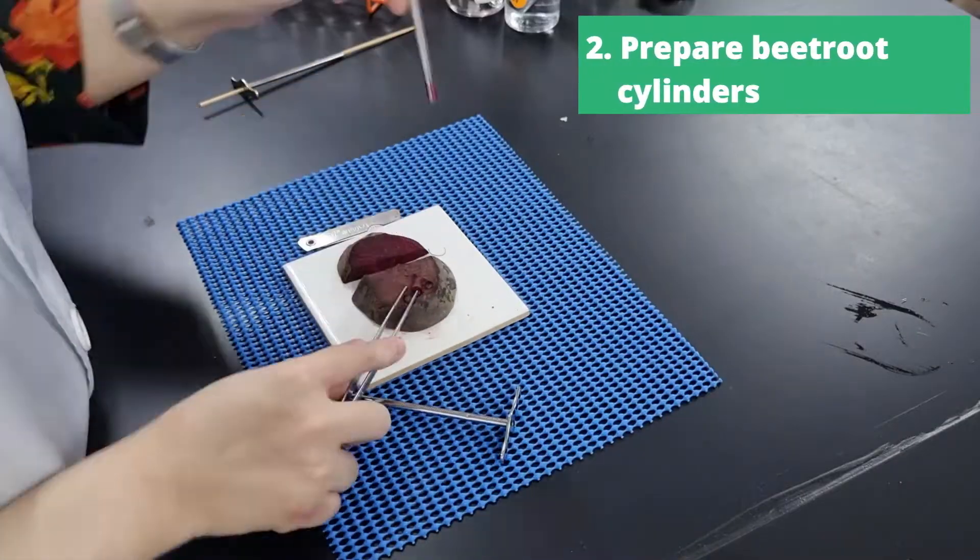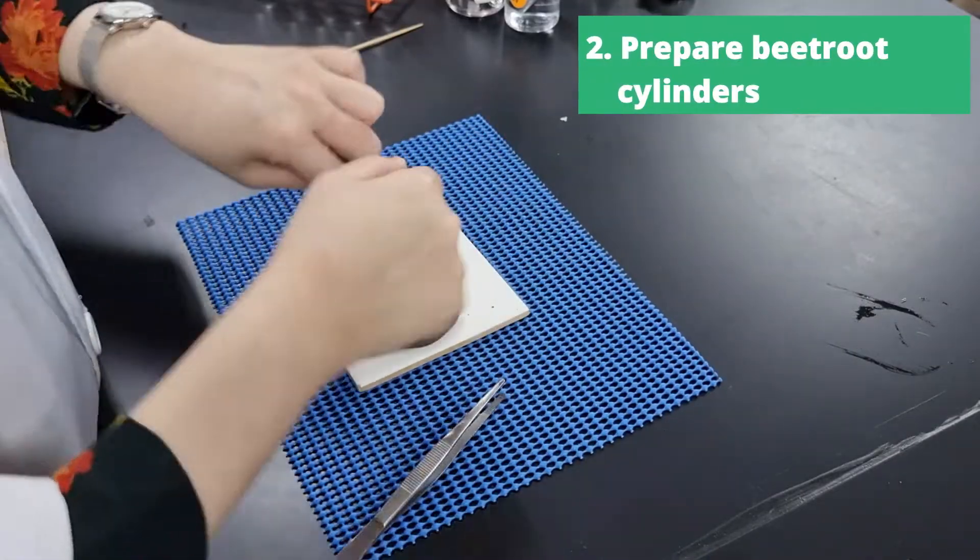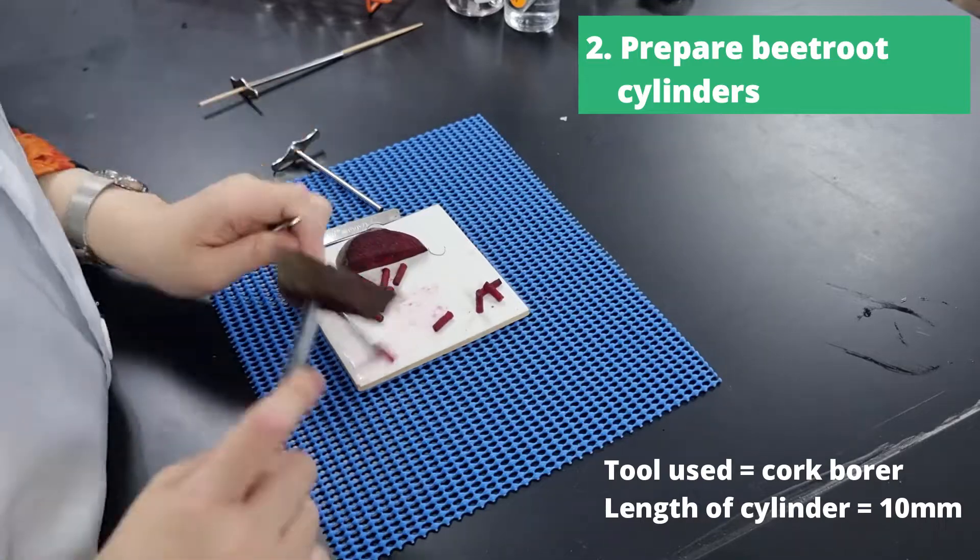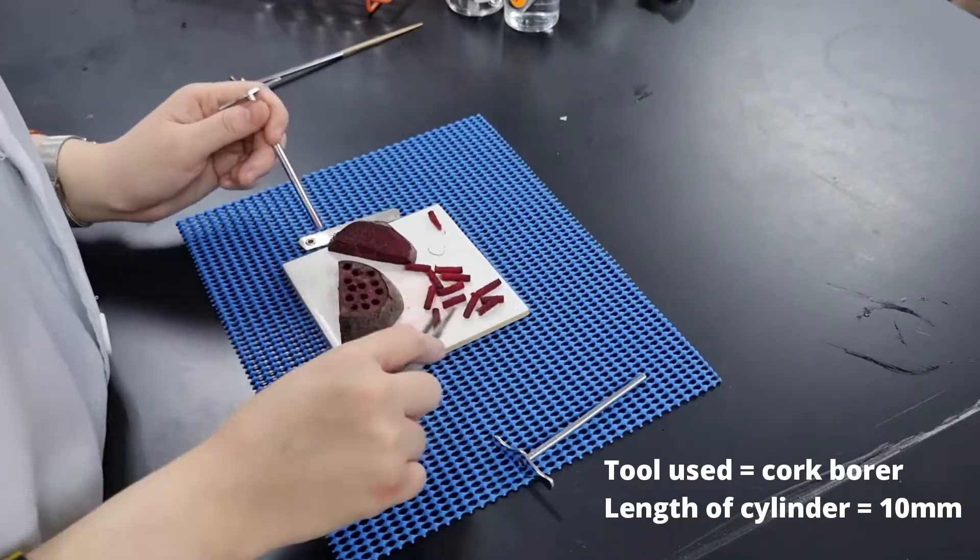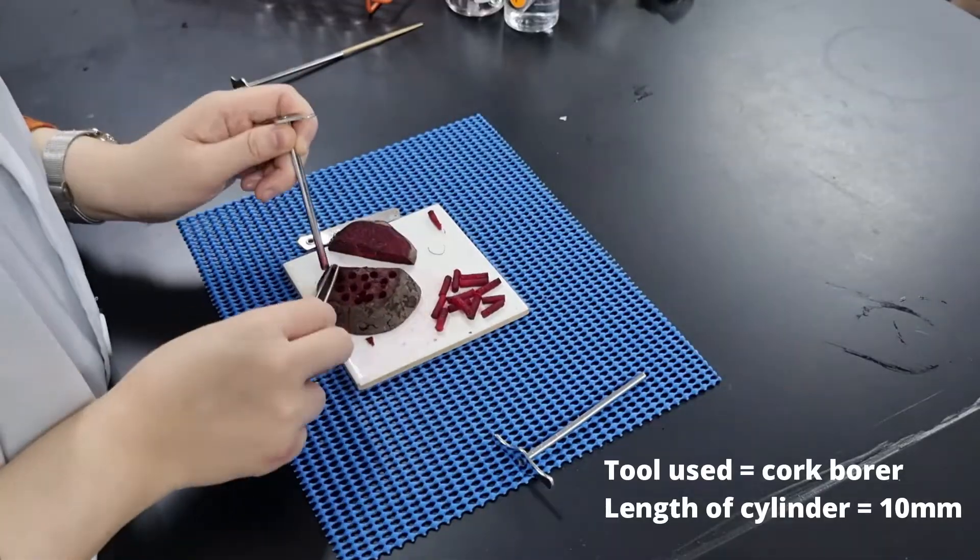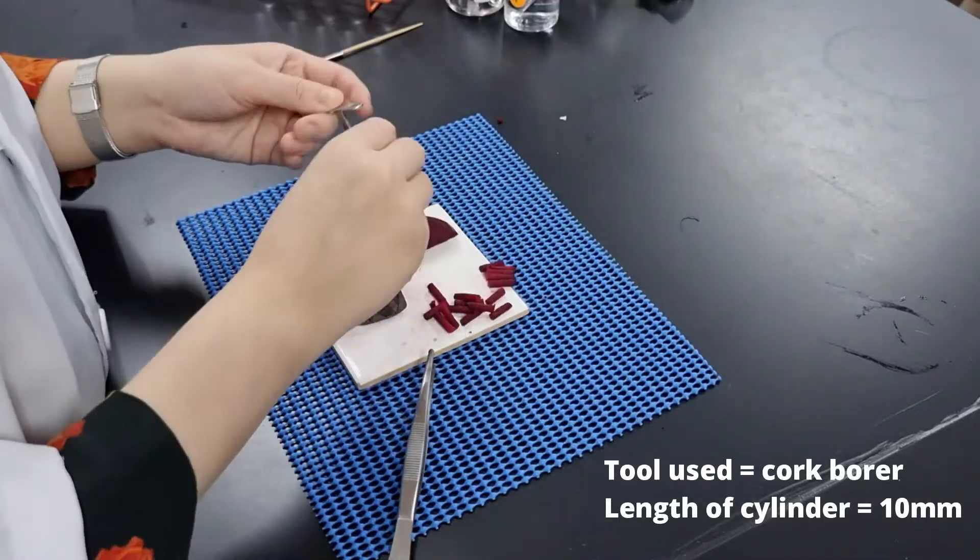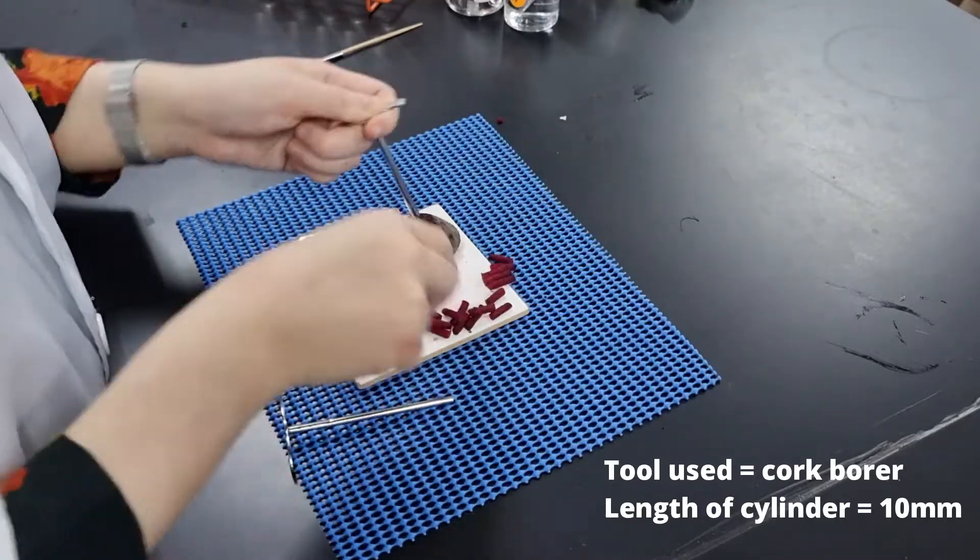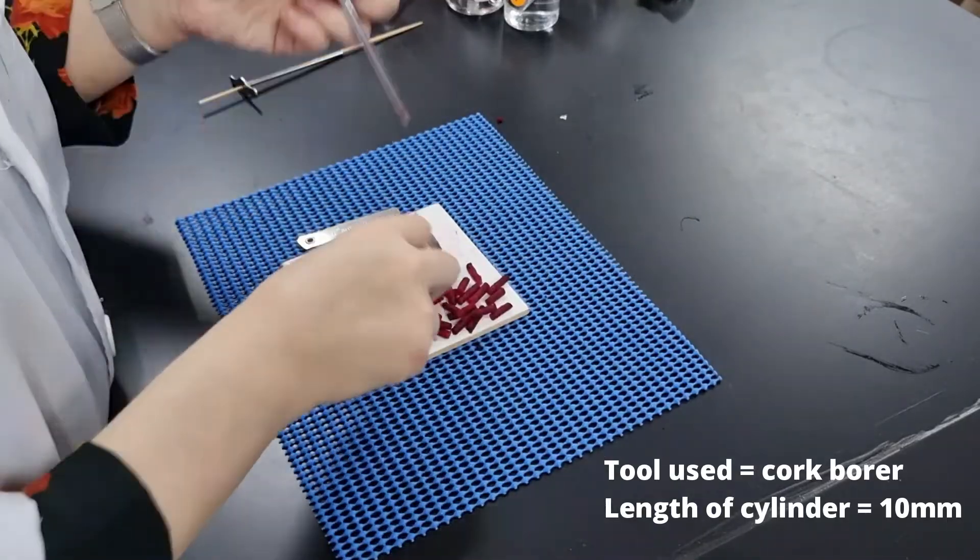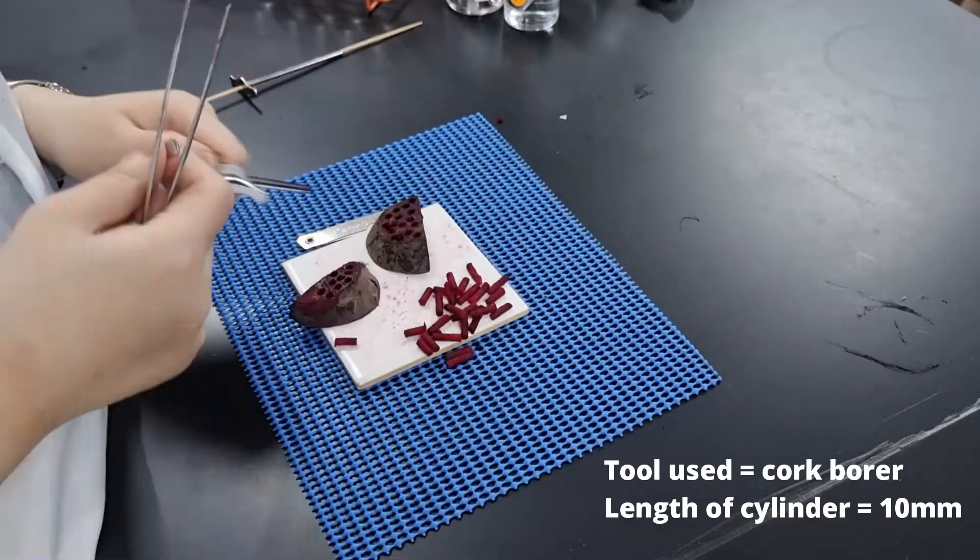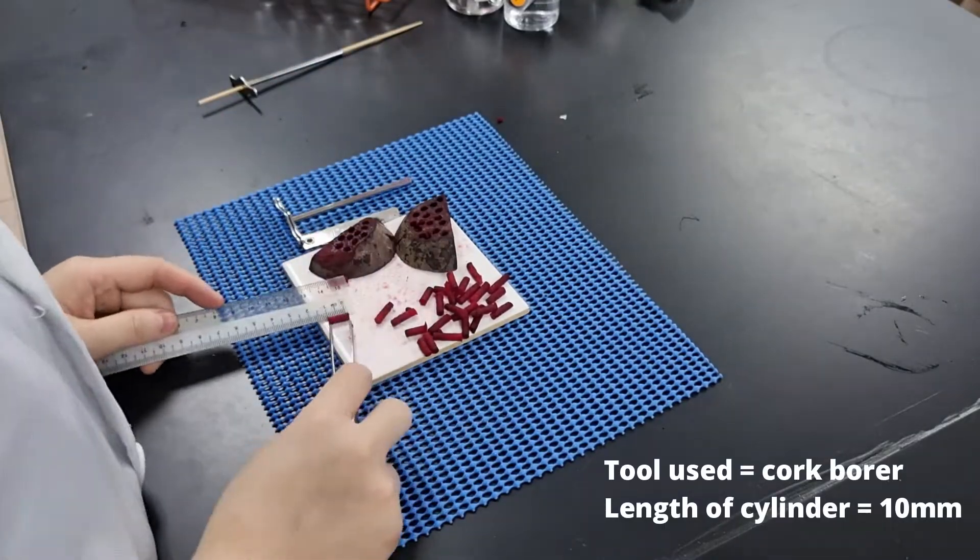Next up, we will be preparing the beetroot cylinder. So we use this tool called cork borer and it will make cylinders for us as we stab it through the beetroot. And then we're going to cut this beetroot into 10 mm long cylinder. So the diameter is already constant because of the cork borer. We just standardize the length to be 10 mm long.